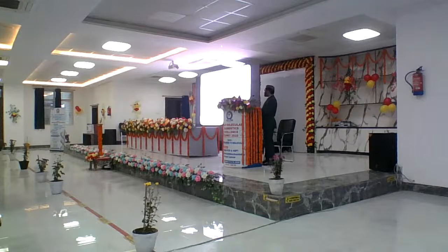Because in your real-time PCR, you repeat your experiment. People say they have great reproducibility, but trust me, reproducibility is a problem there. You can have different CTs every time, but here, if you have an automated droplet generator, the reproducibility is excellent. The only problem is cost, as sir was also saying, the cost is high.